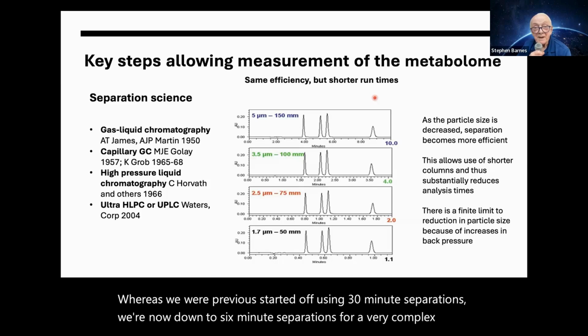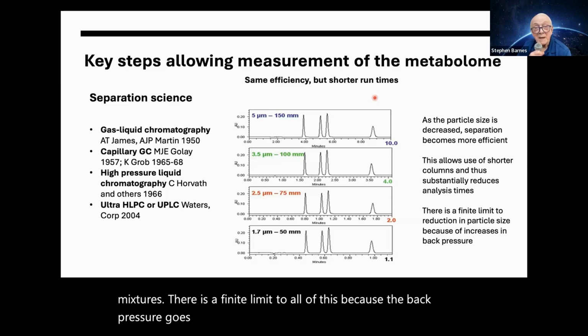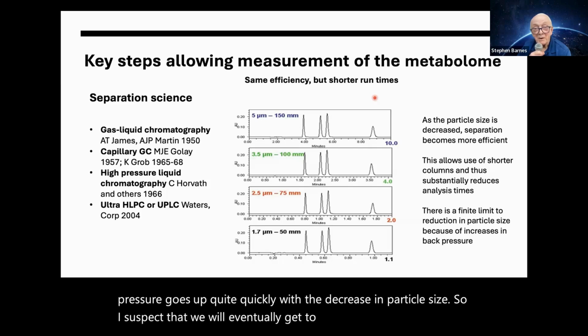There is a finite limit to all of this because the back pressure goes up quite quickly with the decrease in particle size. So I suspect that we will eventually get to an open tubular column for HPLC.